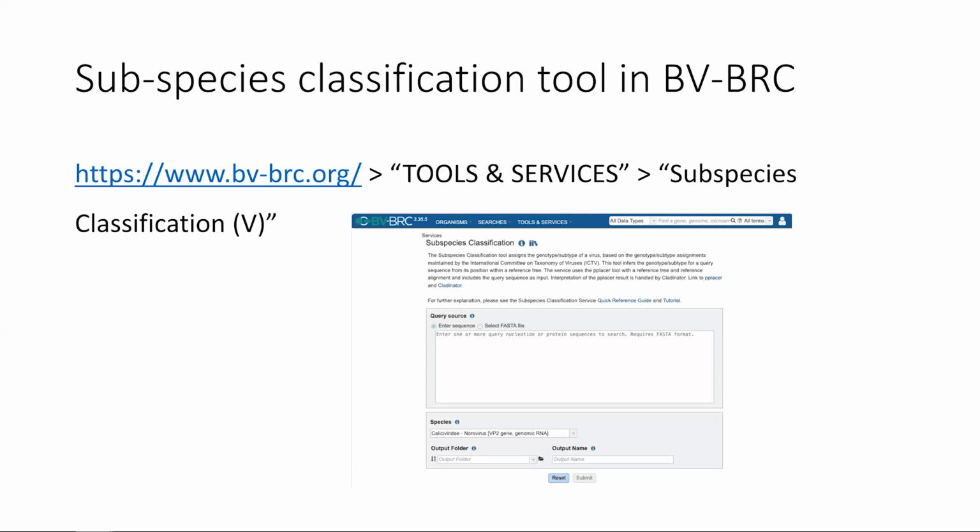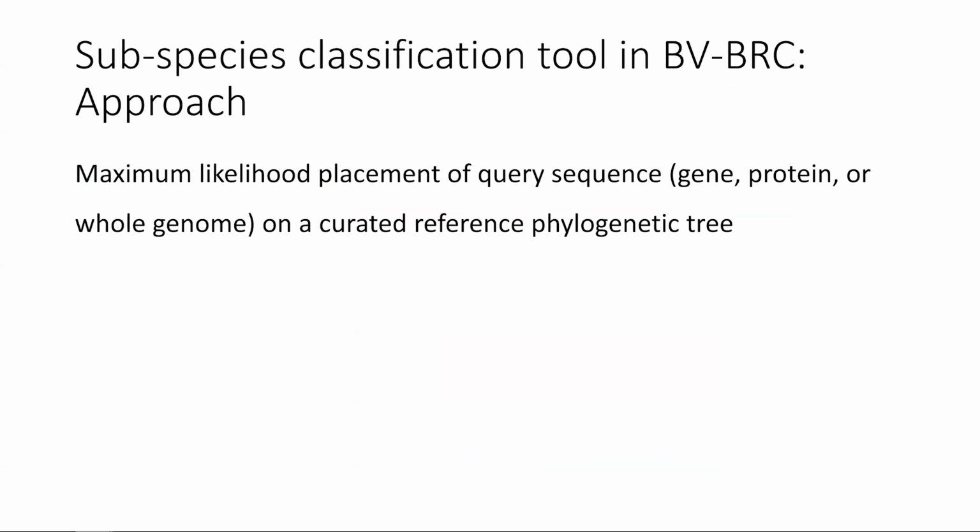And the computational background behind it is what we're using. As I already mentioned, we use reference trees and reference alignments, and then we use a program called pplacer, which places the query sequence on every possible branch of the tree and evaluates the likelihood of that particular placement. So it's a maximum likelihood based method.